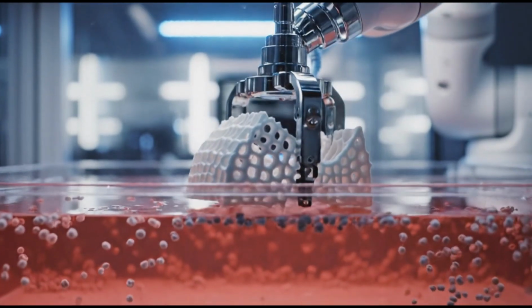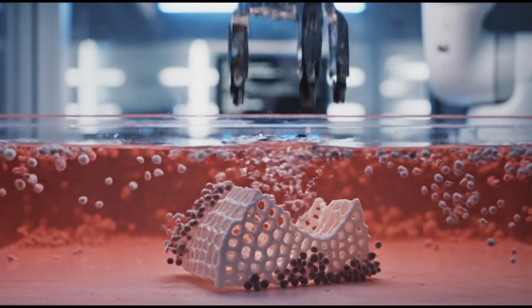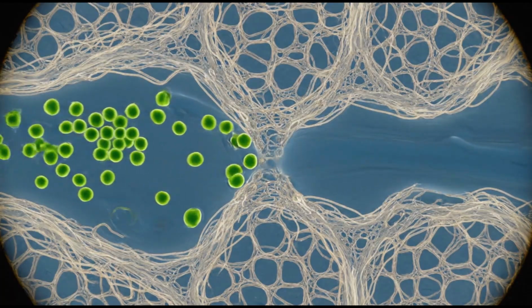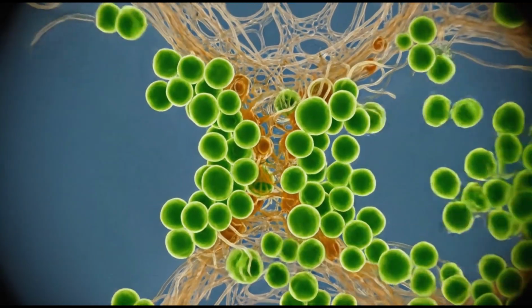Scaffolds introduced gently into cultivation chambers. Robotic arms place scaffolds with precision. Cells remain suspended awaiting attachment. Cultured cells guided onto edible scaffolds. Nutrient flow adjusted to encourage attachment.